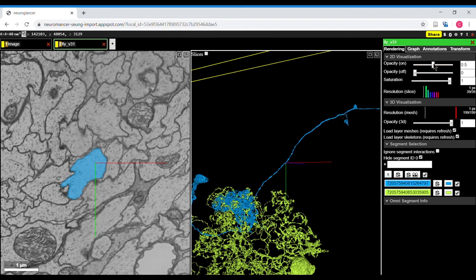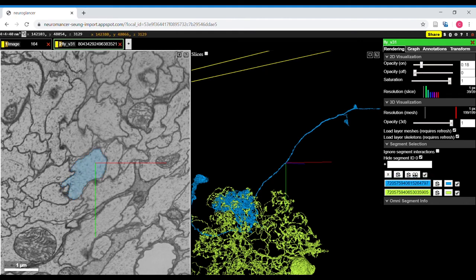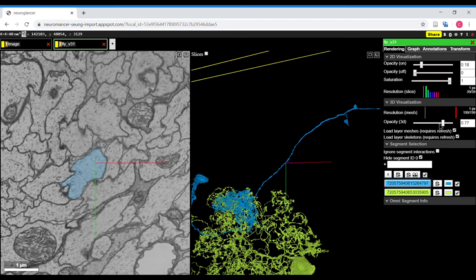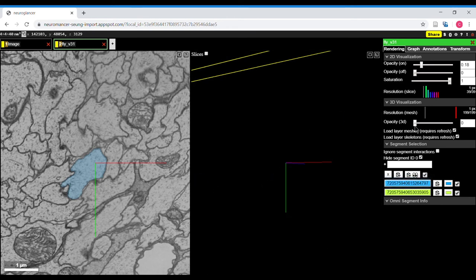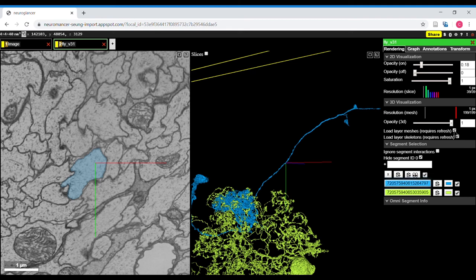Some of the things that it can do are change the opacity of the 2D neuron. So if you look here, you can see that opacity changing. It can also change the opacity of the 3D neuron, which can be useful for various things.